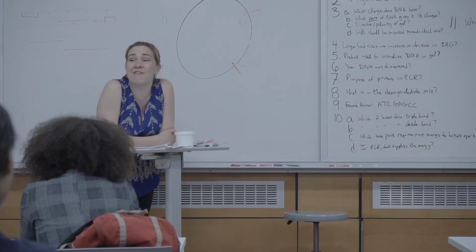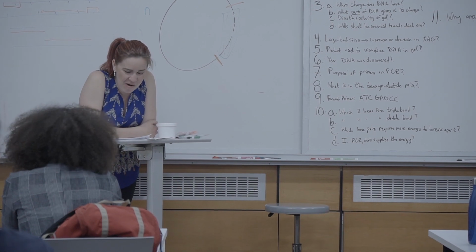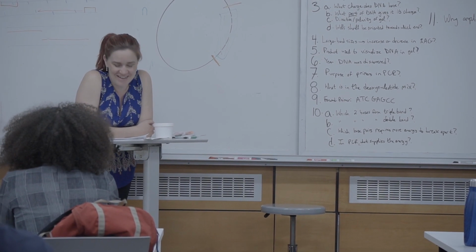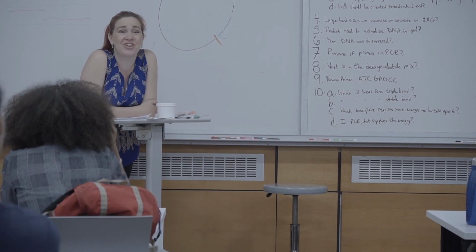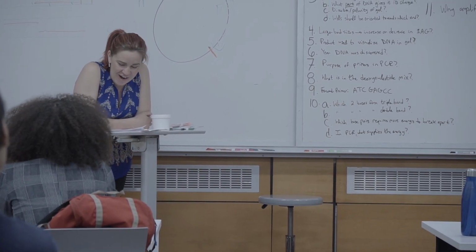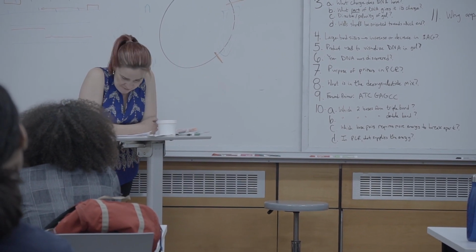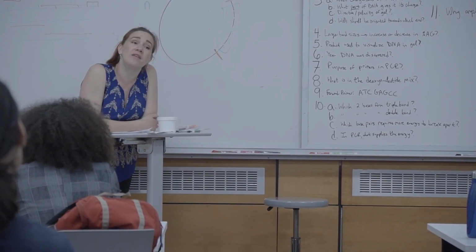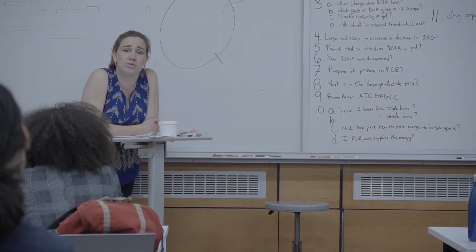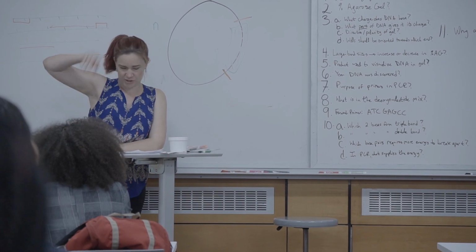What percent gel did we run today? 2%, right. What charge does DNA have? Negative. Excellent. And what gives it that charge? Do we remember? Phosphate. Excellent. What direction does the current run in our gel box? Negative to positive, perfect. So when loading the gels, where do we need to put our wells? Towards the negative end, right? So we repel, push our stuff to the positive.